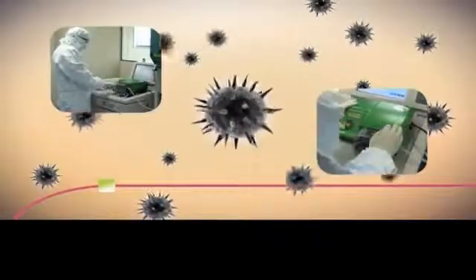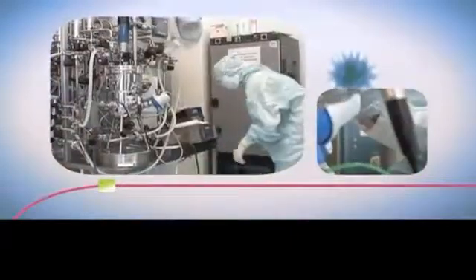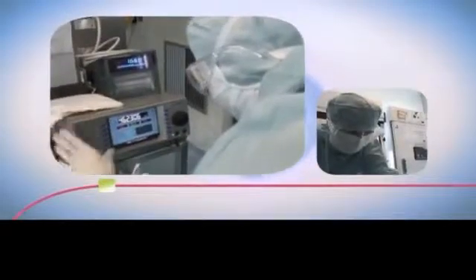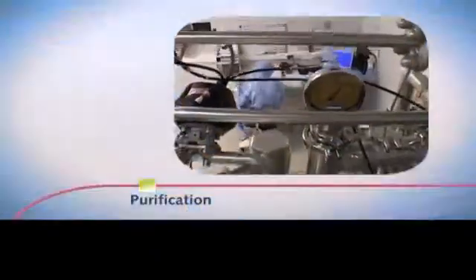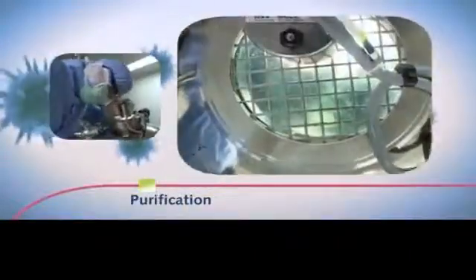Microorganisms are grown in special, complex growth media that may contain up to 30 different ingredients. A wide range of parameters must be taken into account: temperature, pH, oxygen rate, sterility, homogeneity, and so on. Each factor is important. The slightest variation in the culture media may compromise the results. Depending on the vaccine, cell culture takes from 2 days to 3 months. Following harvest, the next step is purification, which eliminates any trace of culture media and any other impurities.